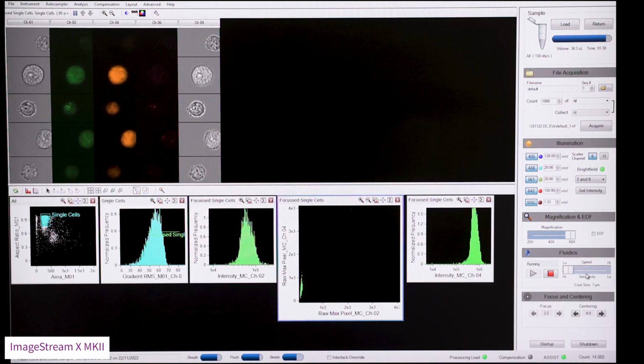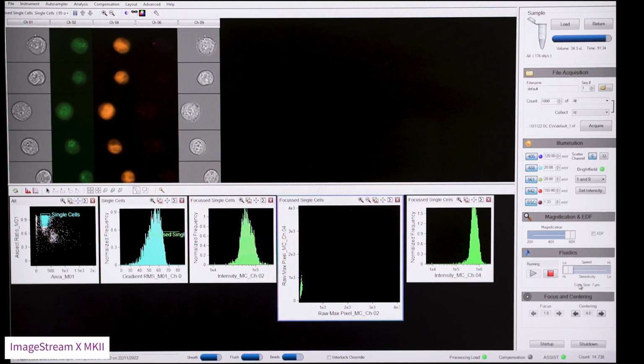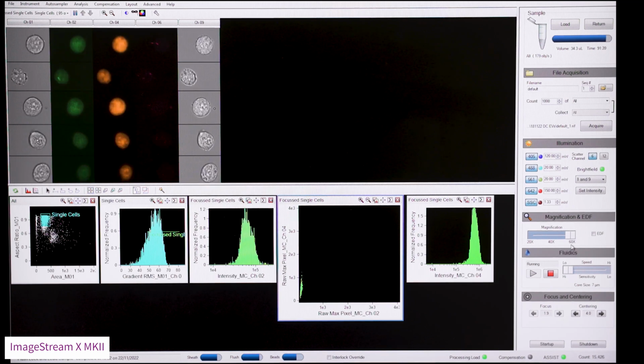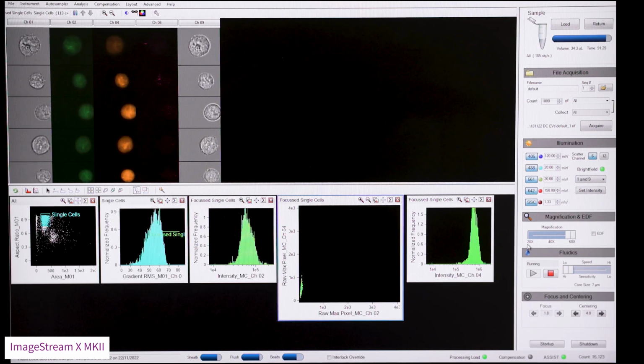Okay, so we've set the laser power for both dyes. We have chosen the magnification. The only remaining option is to change the speed in the fluidics, here on the right-hand side. Usually it's best to leave the machine on its lowest speed.